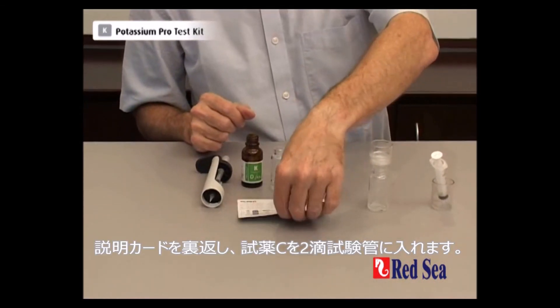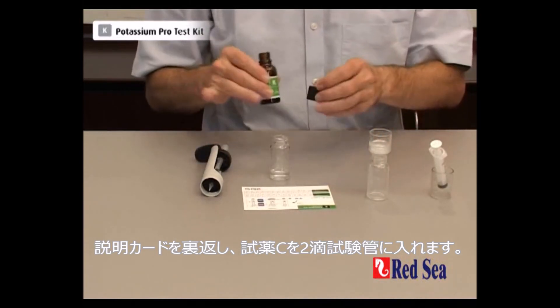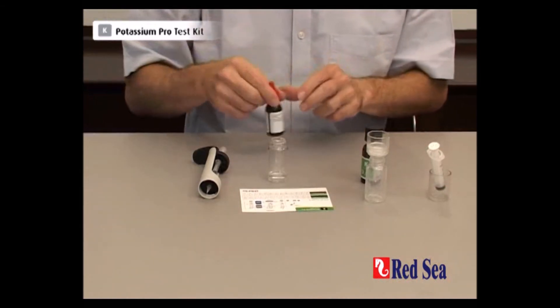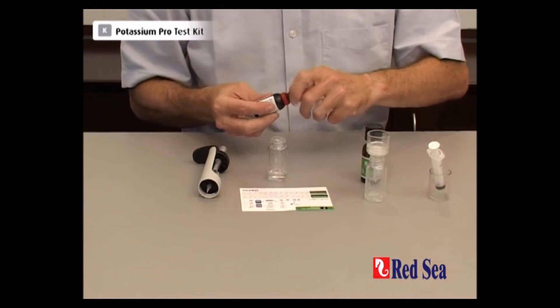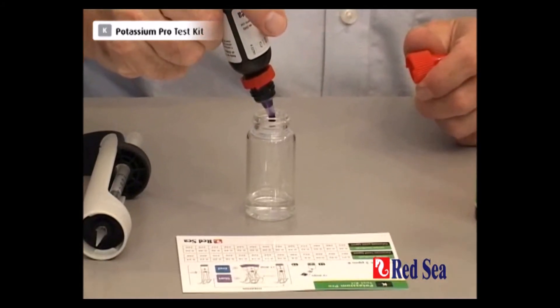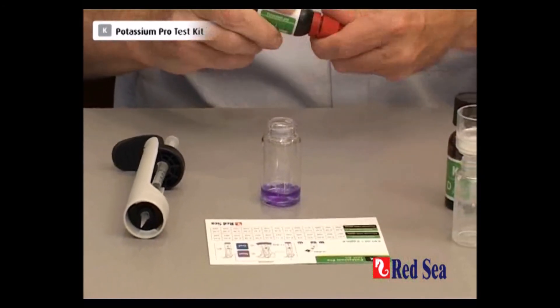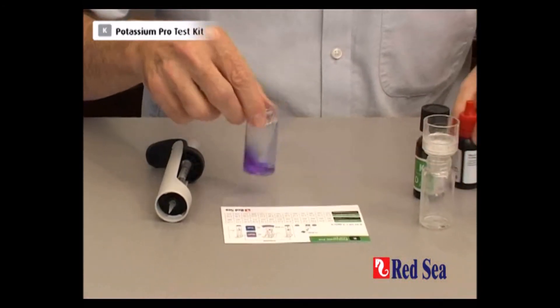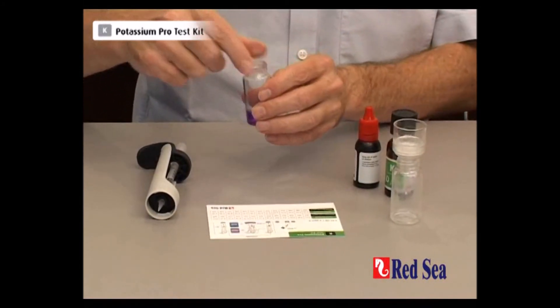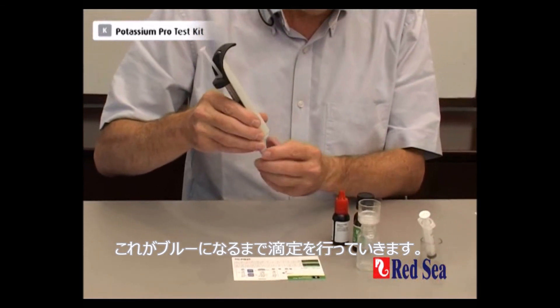Turn the page on the instructions and we put in 2 drops of reagent C — 1, 2. Shake it, and we get this nice purple colour. We're going to add titrant until we get blue.